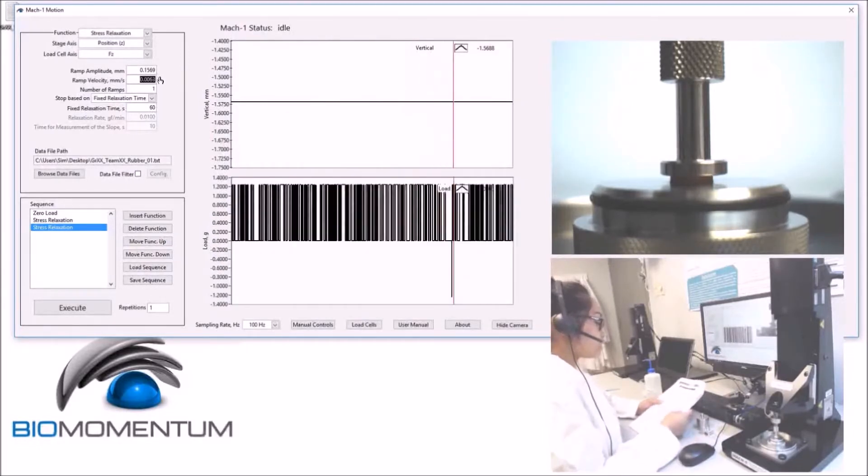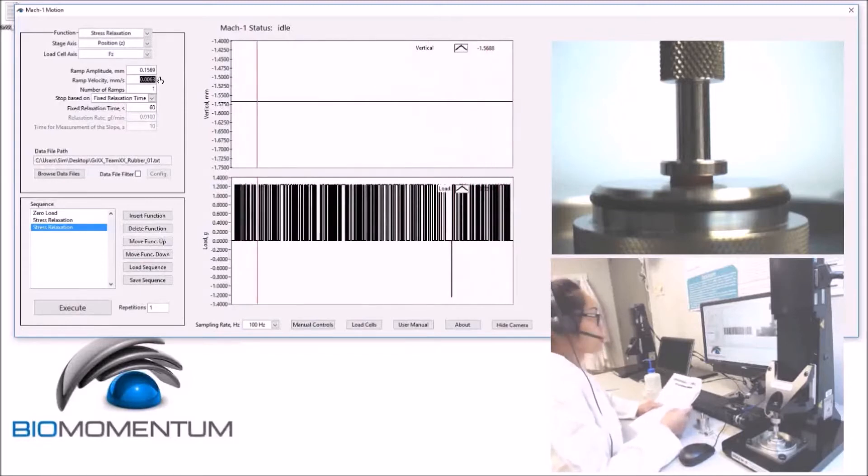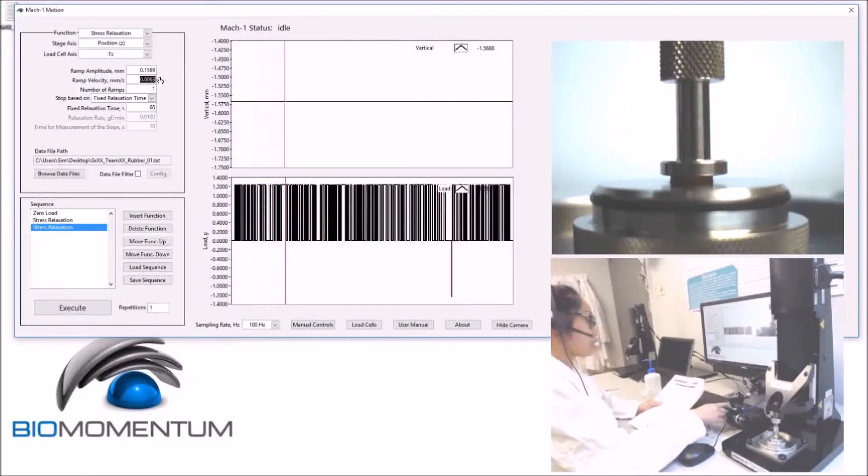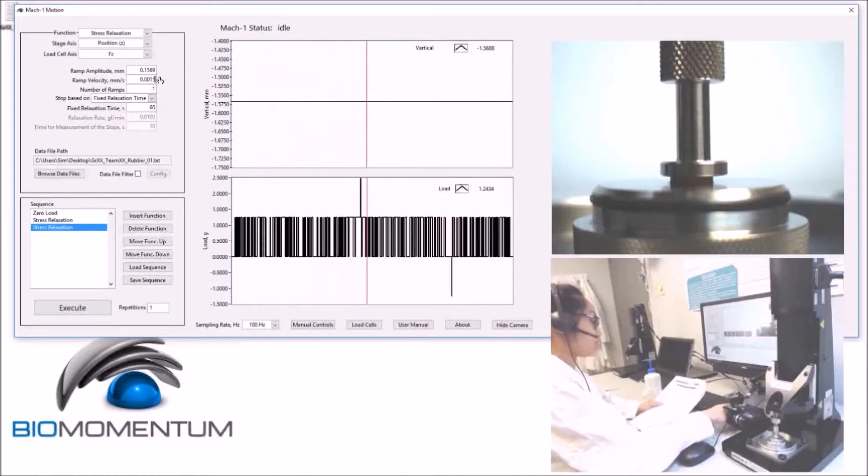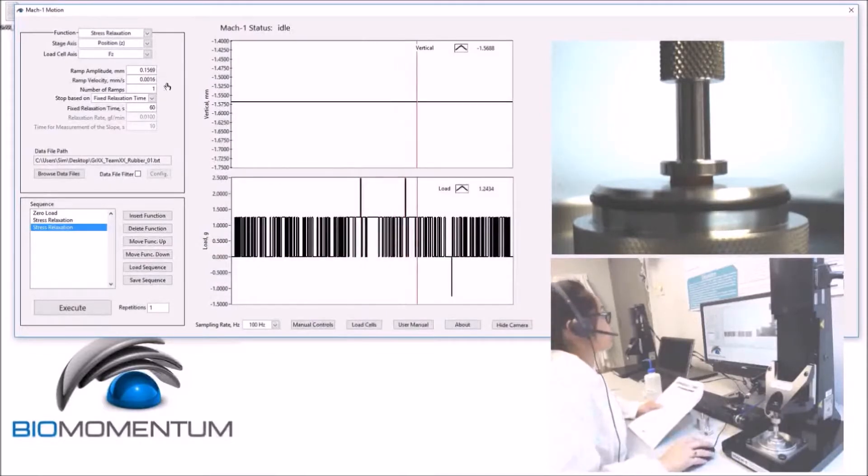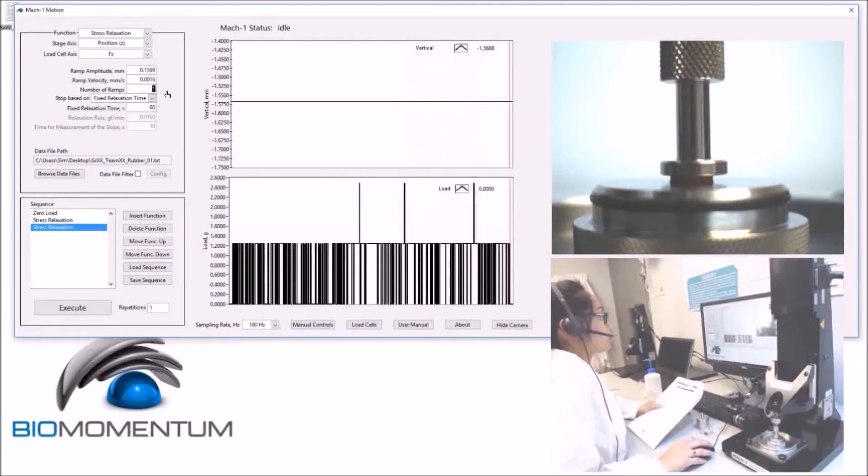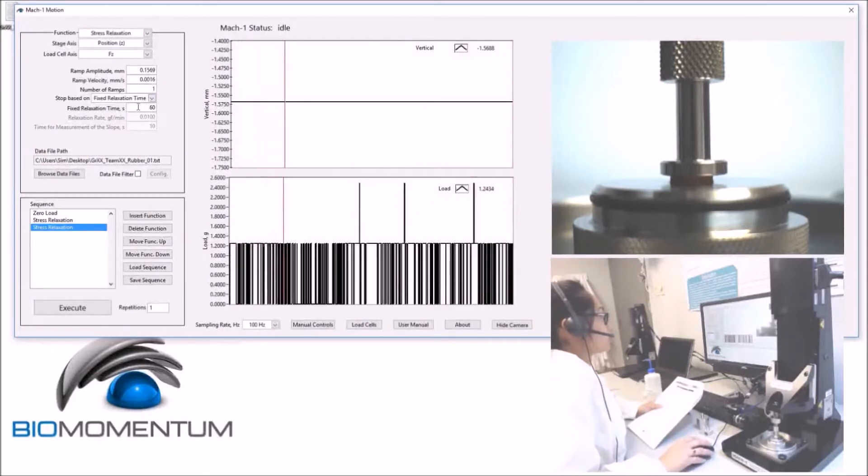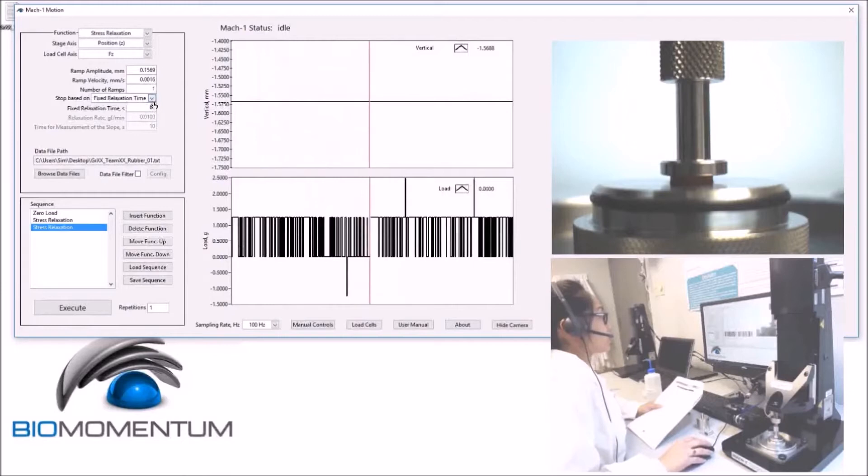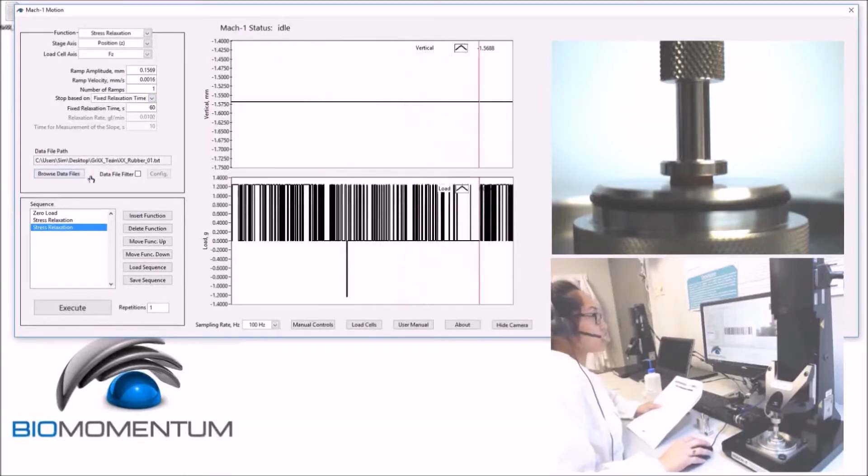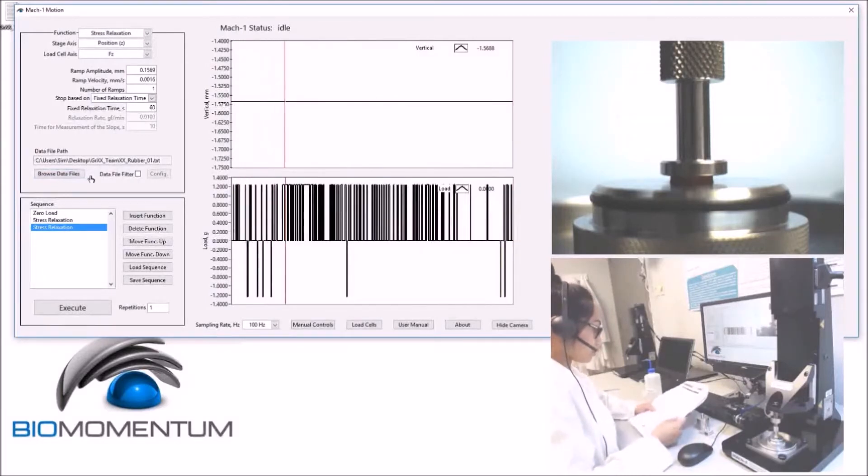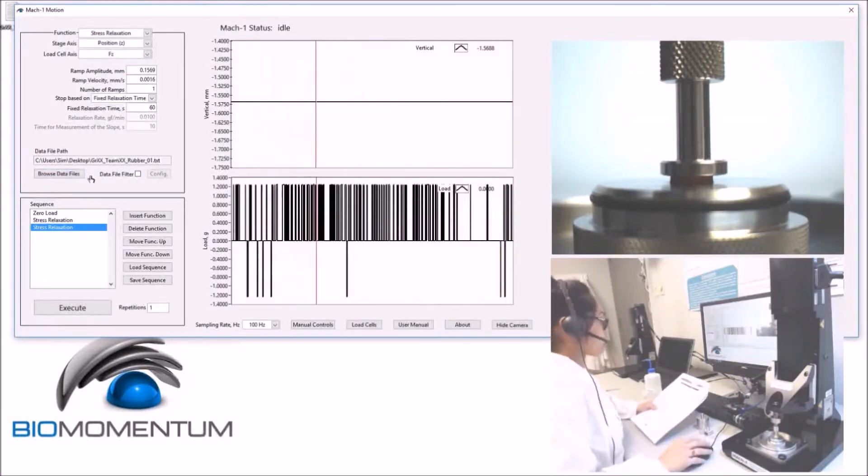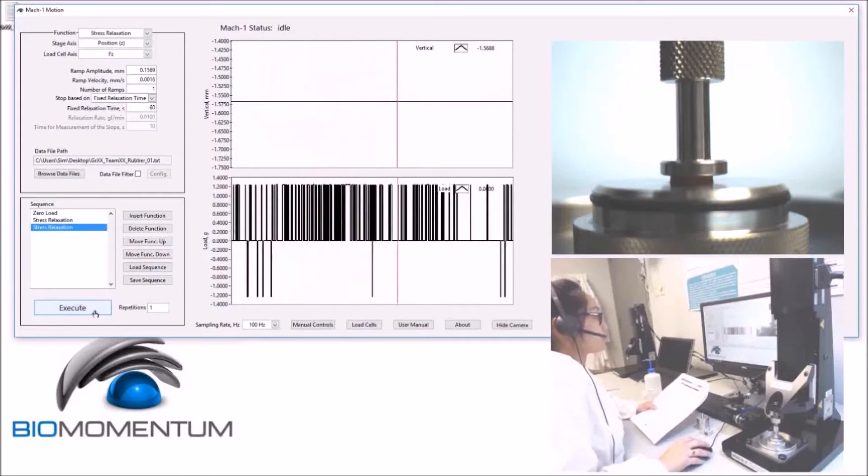and a velocity of 0.1 strain rate, which results in 0.001569. One ramp will be used with the same fixed relaxation time of 60 seconds, and the results will be saved in the same file. We can now press Execute.